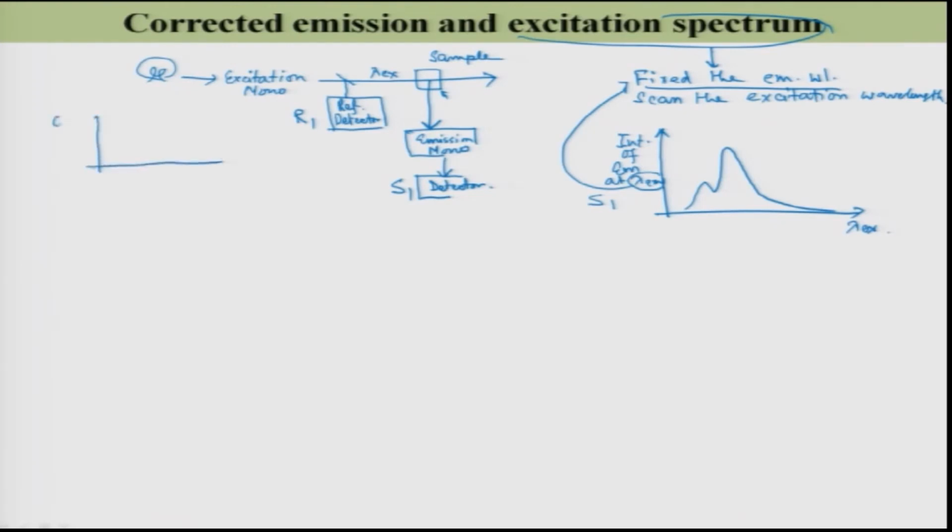So, this output intensity of lamp versus wavelength, which is the lambda excitation later on, is like this. When the lambda excitation is over here, obviously the fluorescence intensity will be small. When the lambda excitation is like this, then fluorescence intensity will be more. Obviously, it also depends on the absorption spectra.